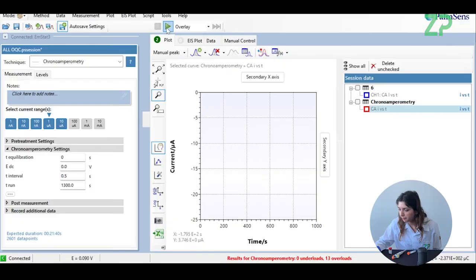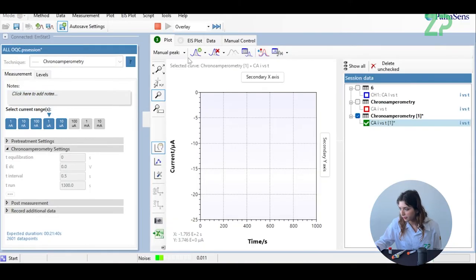So now we're ready to start, so I'll just press play. As you can see, a basic chronoamperometric curve is starting to form, and because it's a generation 2 sensor it is going to be starting from the negative current. And we wait 500 seconds now for this.